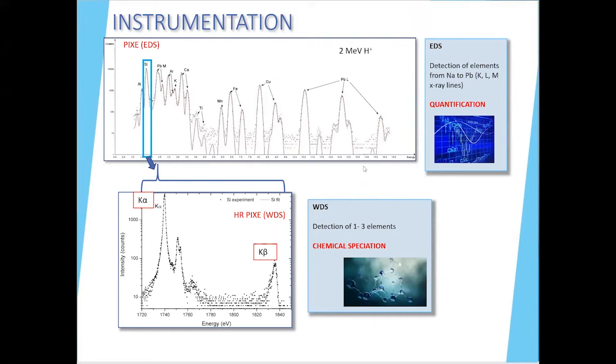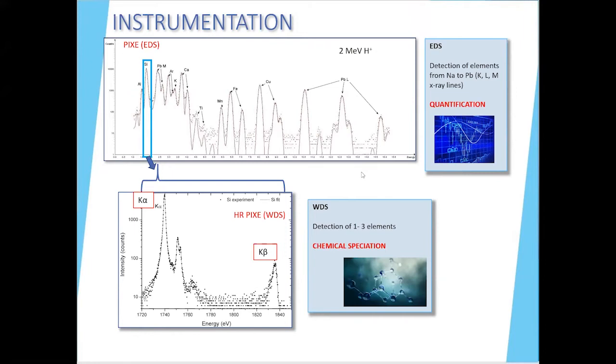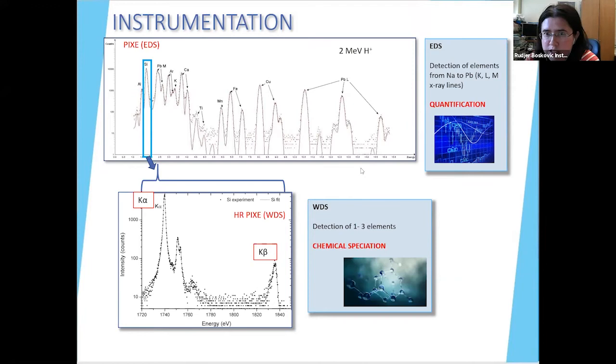Hi, Eva. May I ask you a question? Could we be able to track cadmium and selenium in quantum dots labeled microplastics? I mean, depending on the concentration of the cadmium inside, cadmium we can see through L lines, I think they're around 3 keV.